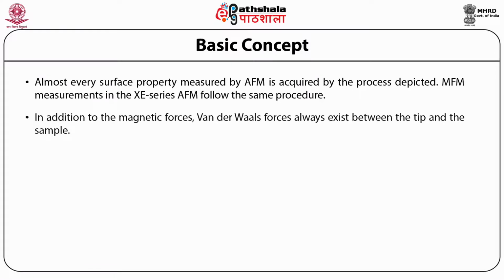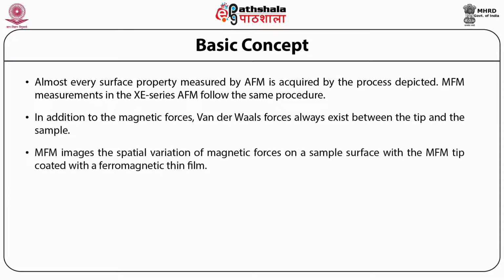However, in addition to the magnetic forces, van der Waals forces always exist between the tip and the sample. These van der Waals forces vary according to the tip-sample distance and therefore are used to measure the surface topography. MFM images the spatial variation of magnetic force on a sample surface with the MFM tip coated with a ferromagnetic thin film.